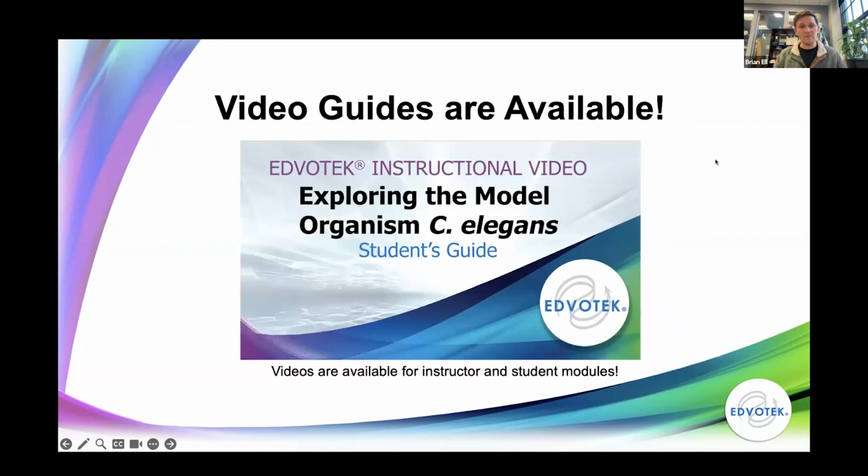I mentioned this last time, but just a reminder that we do have video guides available. There's a lot of great resources that we've created for this experiment. We have our traditional video guides that go over either the student section or the instructor sections, break down each thing individually and show a nice guide all the way through. And then we do have other video resources that look at just specific parts of these experiments. One of the ones we'll be talking about today is on how to perform thrash counts that we'll use for measuring worm survival.